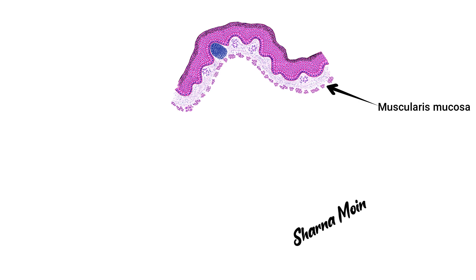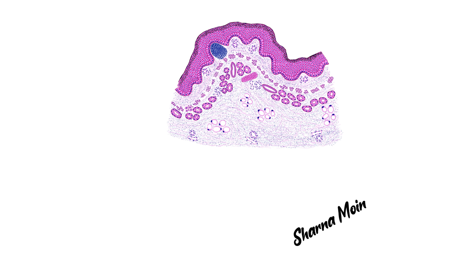Below the lamina propria you can see the fine and thin smooth muscle layer — this is the muscularis mucosa. This smooth muscle layer separates the mucosa from the submucosa and also helps in the movement of the mucosa by its contraction. So all these three layers together form the mucosa.